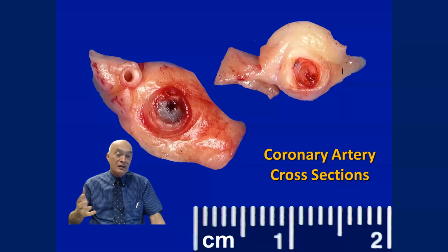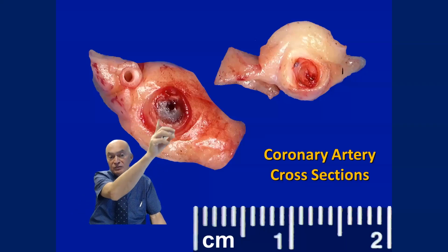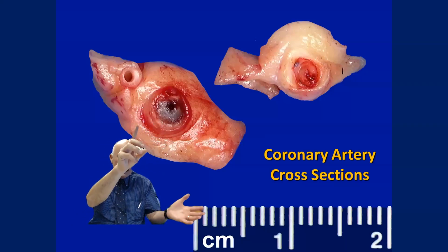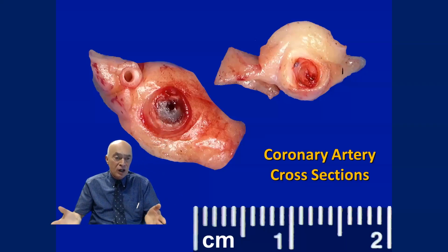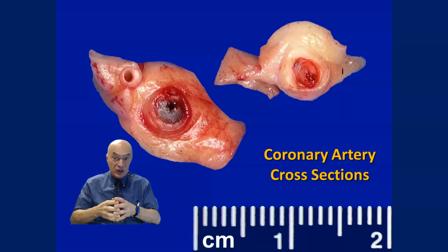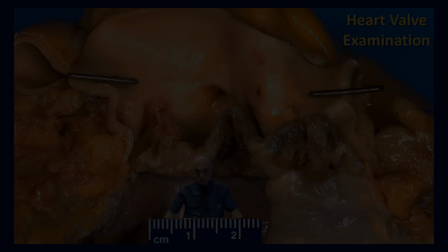And then suddenly he was with his family and died. And then basically what happens is that these clots usually develop in very few minutes, because you have the atherosclerosis around that still allows the passage of blood, but eventually there is a formation of a thrombus, and that's what causes the sudden death in these patients. So there was no time for any transplant or anything like that in this particular case.